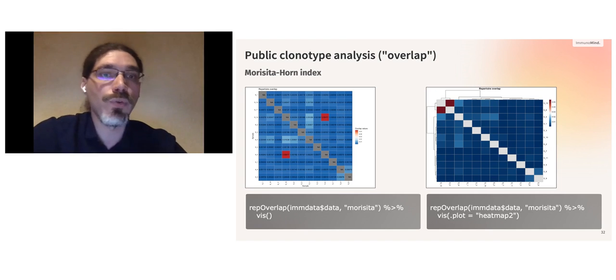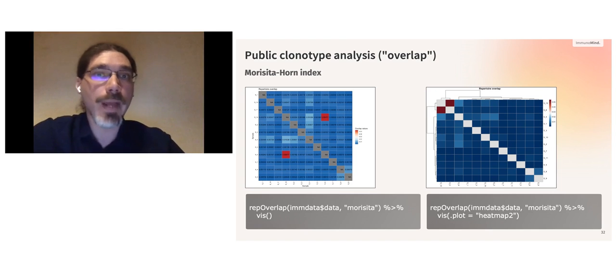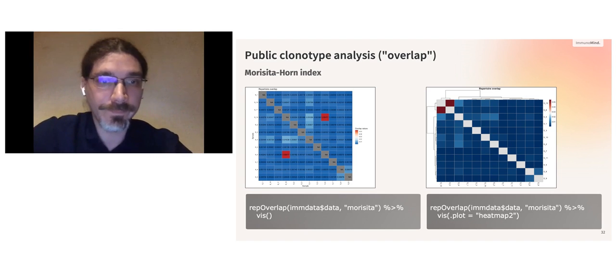It's important to consider. And again, it depends on your hypothesis behind your data analysis.